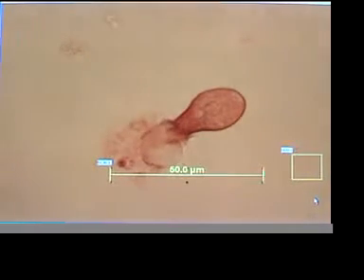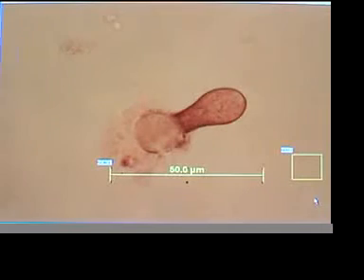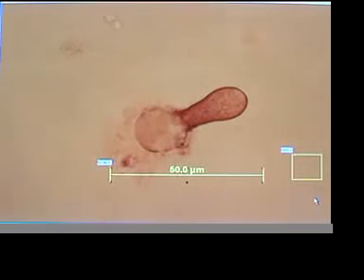Real-time devitalization of Blepharisma. First they are immobilized, and then they are destroyed, dissolved, or molecularly reorganized. We're not sure what. The apparatus that is doing this is a plasma light, helium gas stimulated by pulsed radio frequencies.